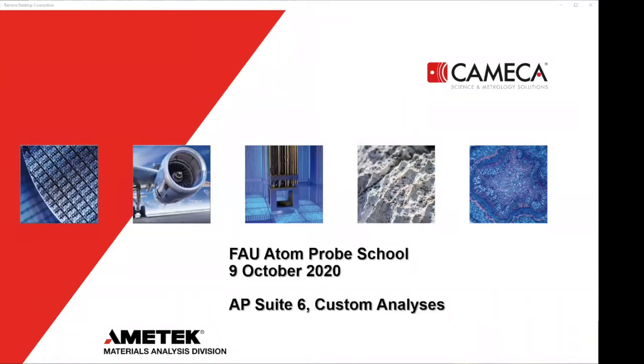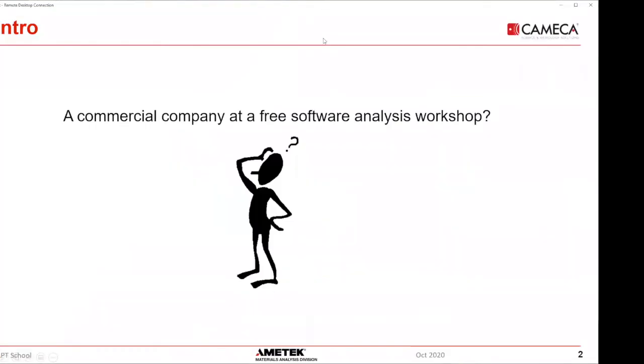Now that the electronics are fairly mature, I have transitioned into the software world, and that's been probably about 10 years now. And when we started the big rewrite of IVAS, they put me in charge, for some reason, of the architecture of the new software. So that's a little bit about me, and let's get started.